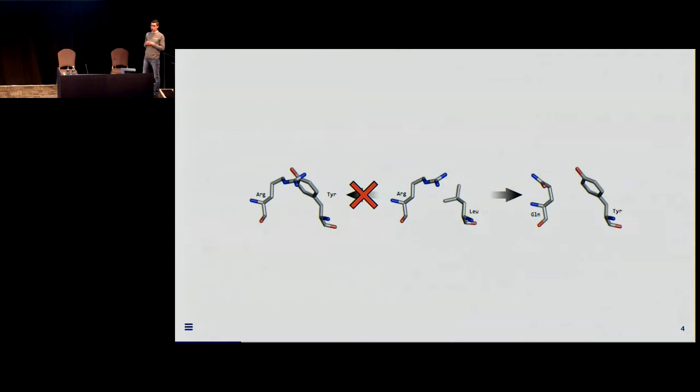And when we do contact predictions, we're trying to observe a covariance signal. When you take the following two amino acids in the middle of this image, and only a single residue of that pair would change, as you can see on the left, then if those two residues are relevant in the structure or function of this protein, that change would most likely be selected against. However, if you go from the center of this image to the right, where both residues change simultaneously, then if this change gets accepted, this will ultimately lead to what we're trying to observe, this covariance signal. So the change from here to here.